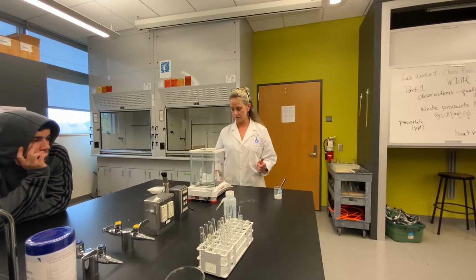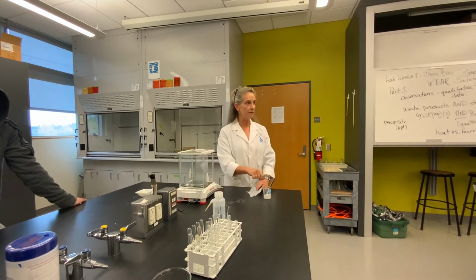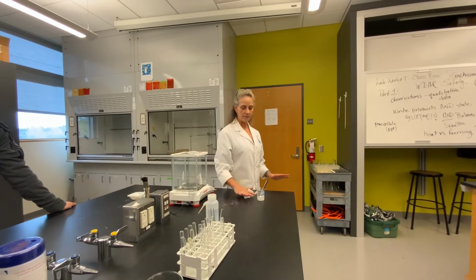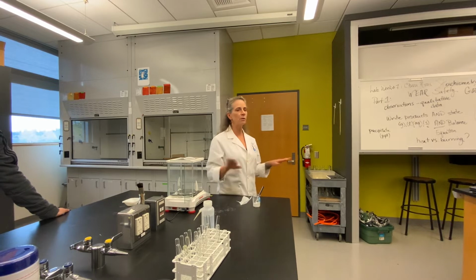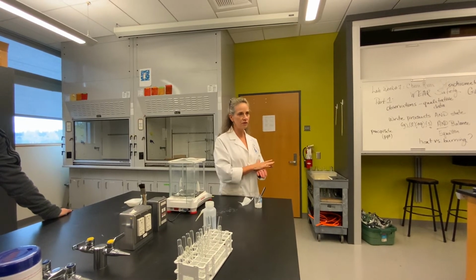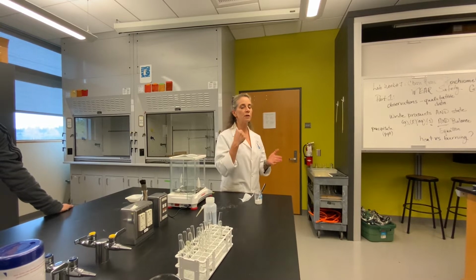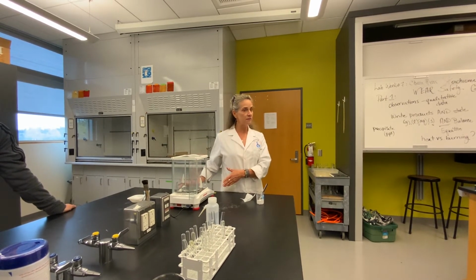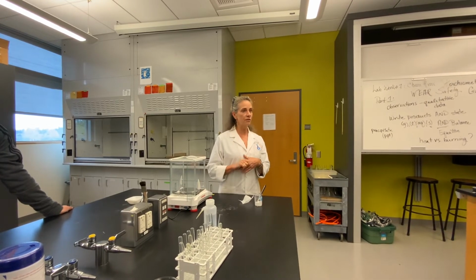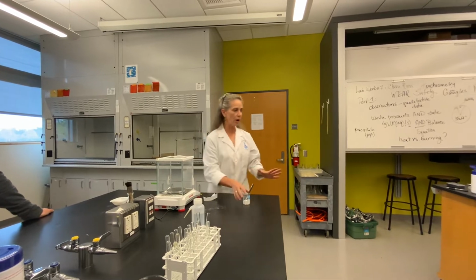Taring out the scale, right? Taking it off the balance to add the mass. And in this lab, it asks you to do approximately 2 grams. I don't want you to waste time trying to get it exactly 2 grams. I want you to be somewhere near 2 grams, okay? But we want you to write down exactly what it says on the balance, okay? That goes in the first table, all right? So that's the first part of the lab.